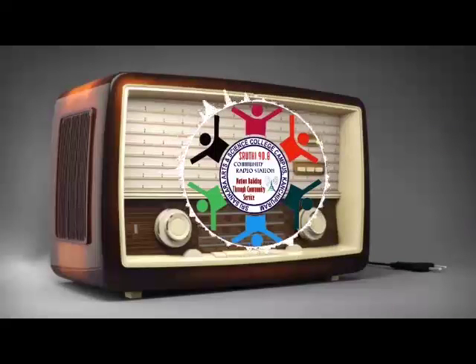The third type is airlift bioreactor. This type of reactor works on the principle of an airlift pump. Based on the airlift pump, it is further classified into two types, internal loop type and external loop type. In this type of reactor, the reactor's volume is determined by its capacity, kinetic data and specific growth rate of the microorganism, and the rate of airflow of the reactor depends on the volumetric mass transfer coefficient in the reaction system.